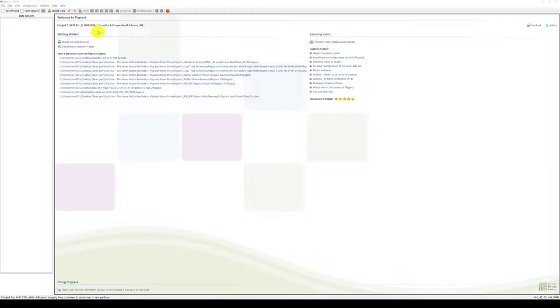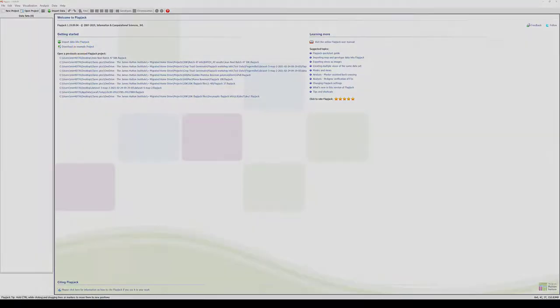We are now ready to import our data and create a Flapjack project. Please move on to the next tutorial for more information.